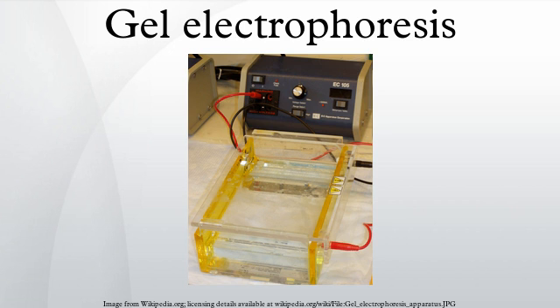Most agarose gels are made with between 0.7% and 2% agarose dissolved in electrophoresis buffer. Up to 3% can be used for separating very tiny fragments, but a vertical polyacrylamide gel is more appropriate in this case. Low percentage gels are very weak and may break when you try to lift them. High percentage gels are often brittle and do not set evenly. 1% gels are common for many applications.